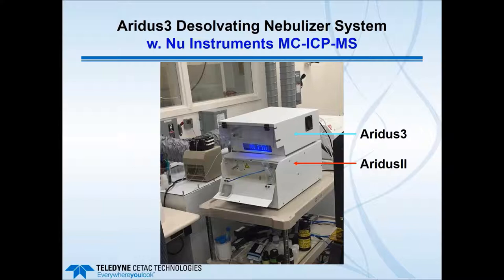Also, you see to the left is a peristaltic pump, and that was set up and simply turned on to drain or connect to the spray chamber drain in case there was any liquid accumulation.